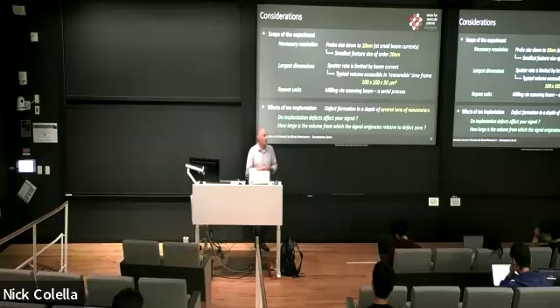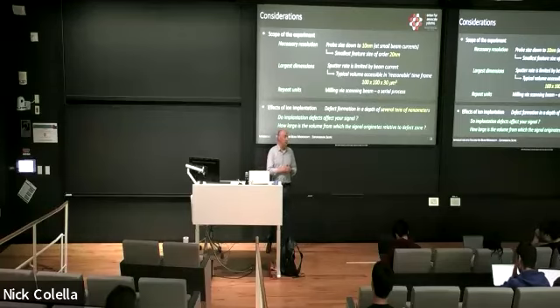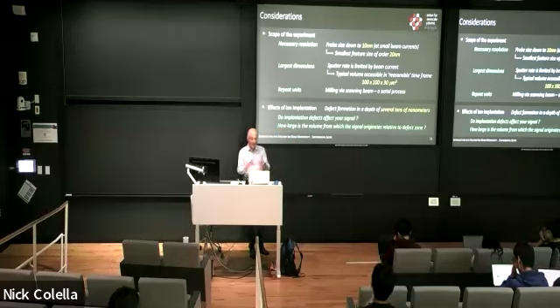There was the idea to generate micro lenses around NV centers, and that had to be given up because the implantation of the gallium generated so many optical states that would have overwhelmed the signature of the NV centers themselves. And I will later hopefully give you a little bit better sense of what that implantation looks like.